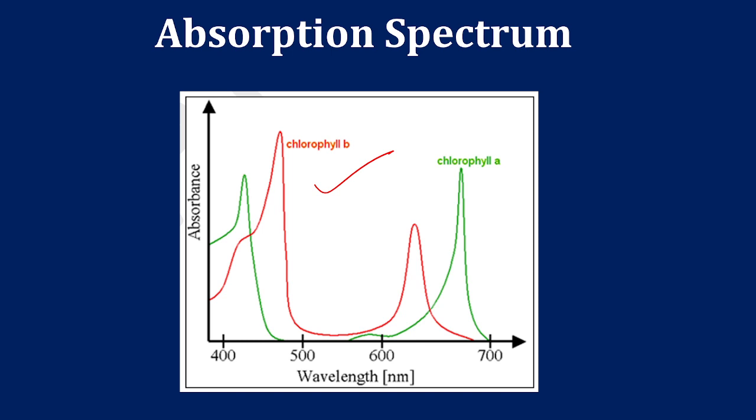In between what parameters is it plotted, that is most important. The graph plotted on the computer screen is between wavelength as well as absorbance. So percentage of absorbance, or the absorbance, and wavelength. If you plot a graph between the wavelength, which is to be taken on the x-axis, and the absorbance, which you take on the y-axis, it will form a plot like this. So on the x-axis you need to take lambda, on the y-axis you need to take the absorbance. Okay, so this is a particular spectrum, an absorption spectrum. Actually there are two different types of spectra, emission as well as absorption spectrum, but this spectrum completely belongs to the absorption spectrum. Got it?